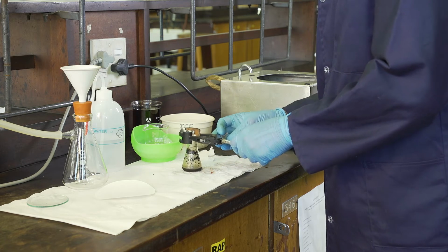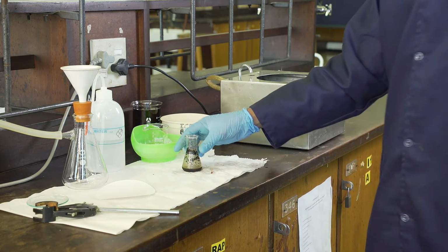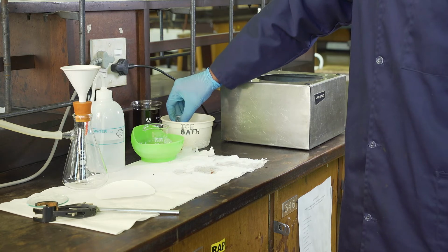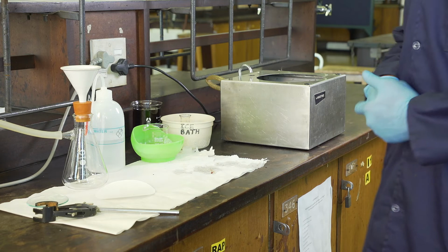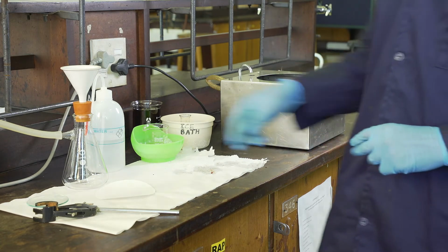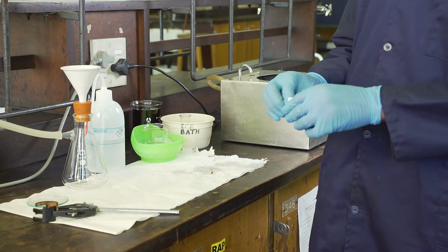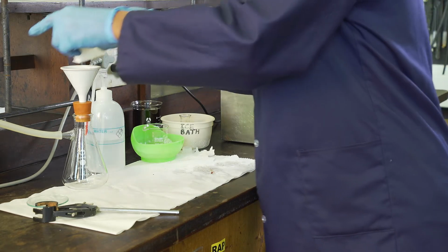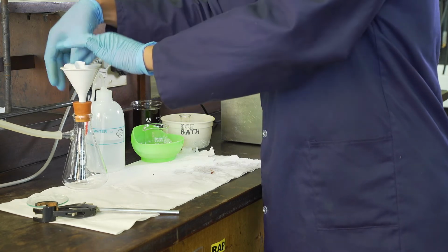Once our 15 minutes of swirling over the steam bath has elapsed, we then allow our conical flask and its contents to cool down to room temperature for about 10 minutes. For a further 10 minutes, we will then cool our contents in an ice bath. That will then be followed by pre-weighing our filter paper and inserting it into our Hirsch funnel for filtration.